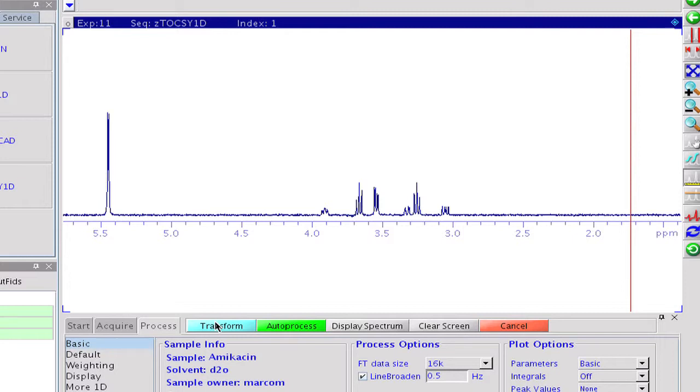The multiplets are undistorted and high resolution conditions are fully retained. Coupling constants are easy to extract and can be used to determine the relative configurations of the asymmetric carbon atoms in the sugar ring.